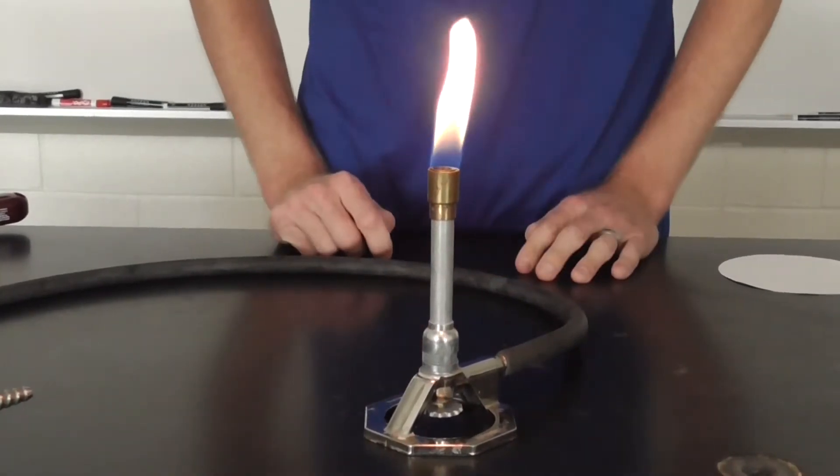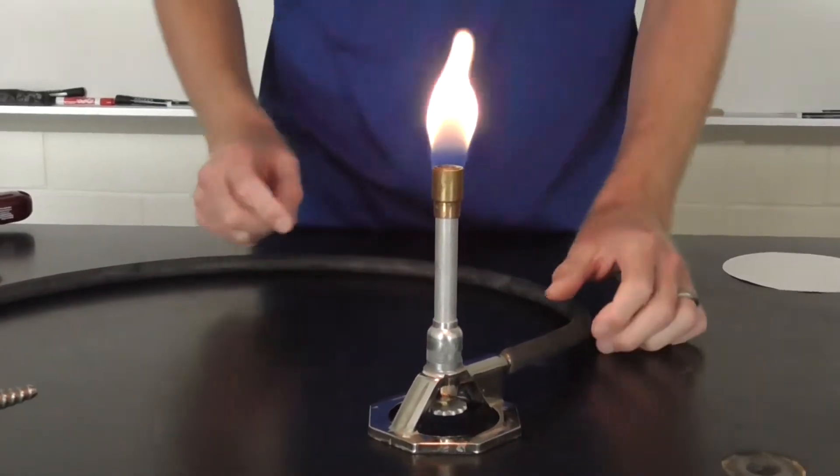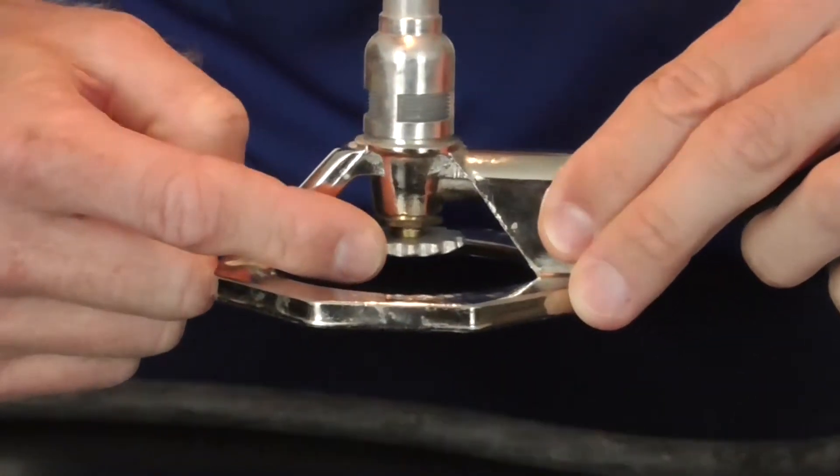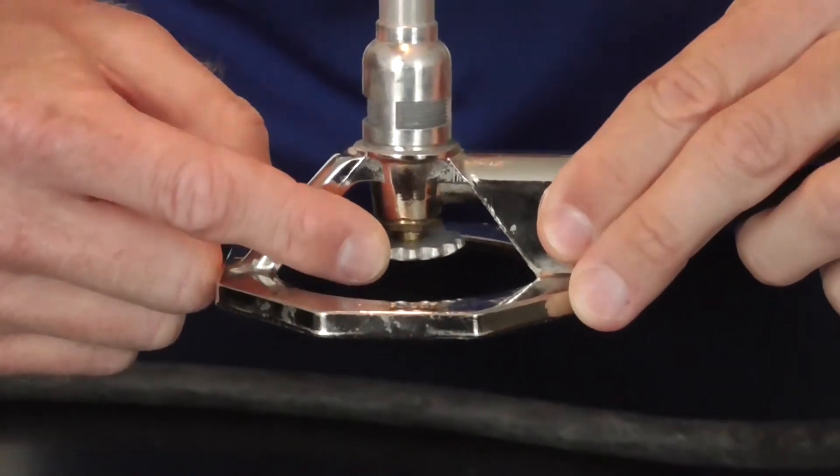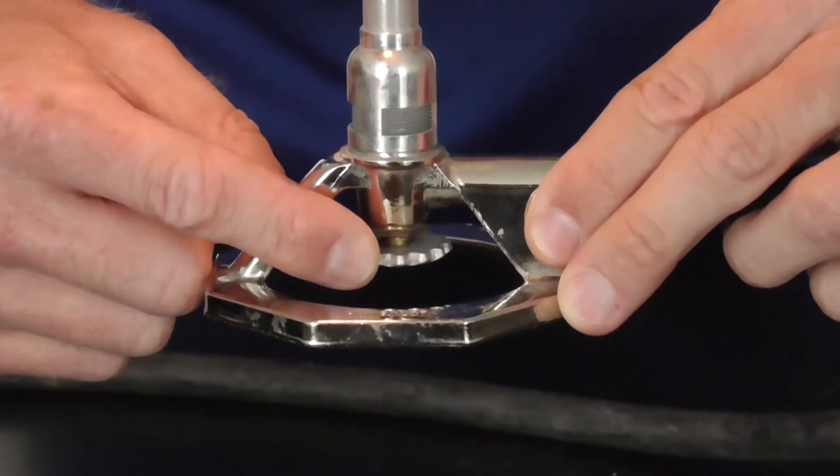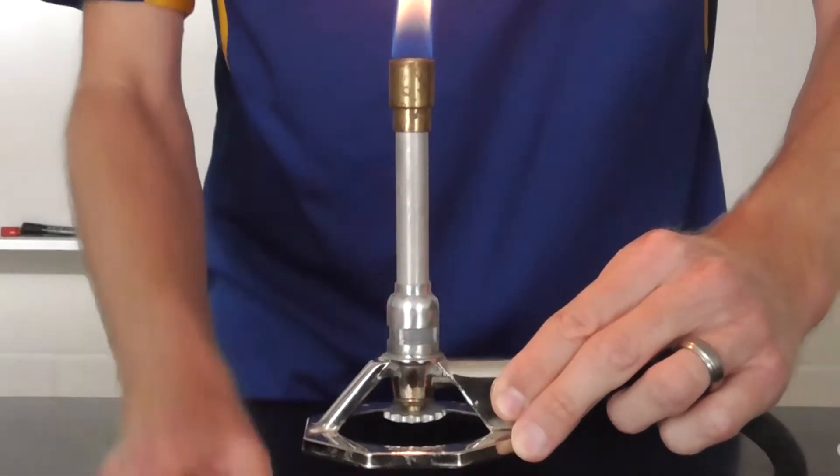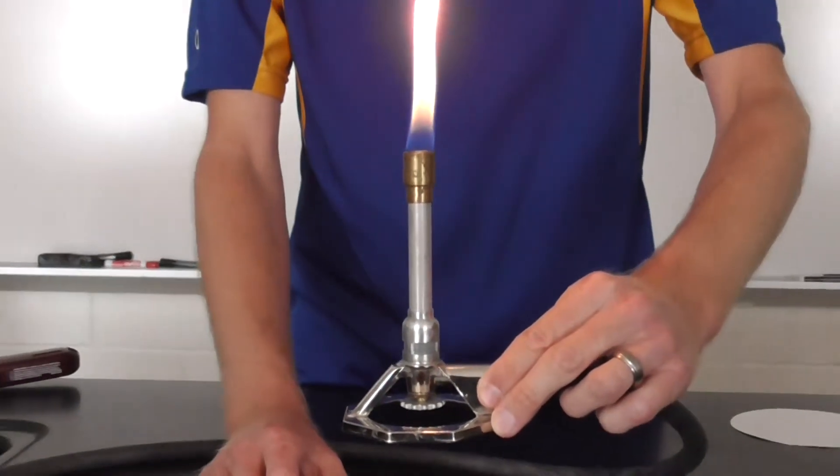Now there's two adjustments that can be made on the Bunsen burner. On the bottom, there's a screw. This screw controls how much gas goes through the valve. There's also this barrel. This barrel swivels, and the barrel controls how much air flows through.